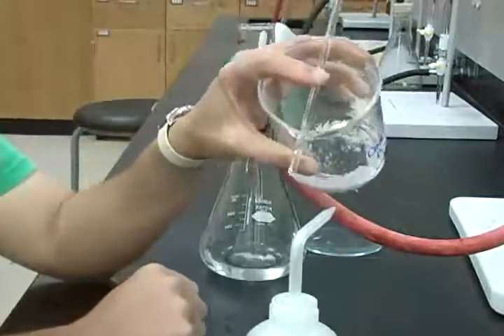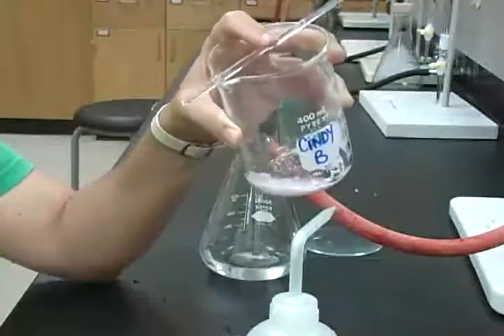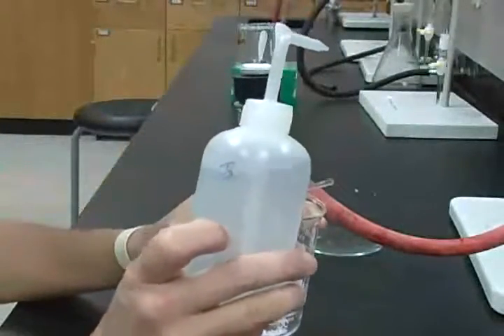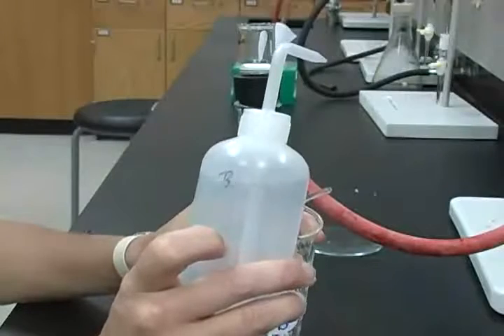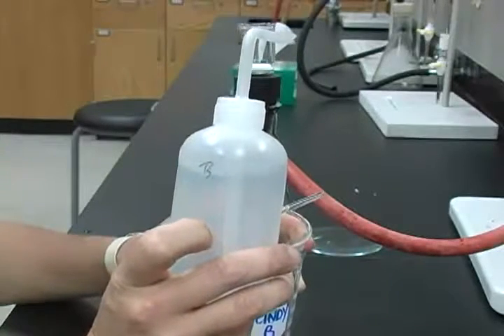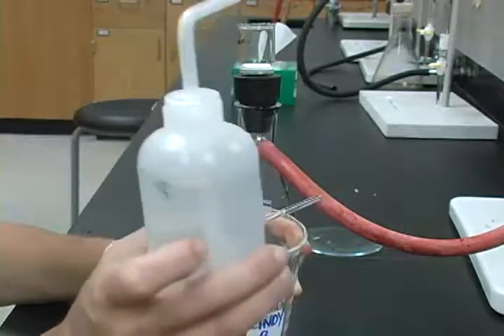After the supernatant liquid layer has been completely decanted, you begin washing the precipitate using a wash solution that was prepared by mixing 3 to 5 milliliters of dilute nitric acid to a liter of water. You can pour that total mixture into a plastic storage bottle and then fill up your wash bottles as it's needed.